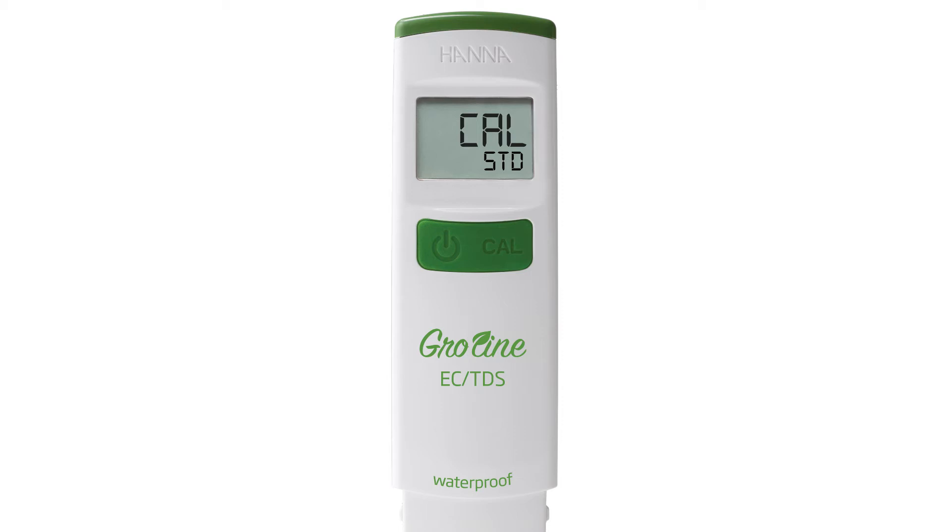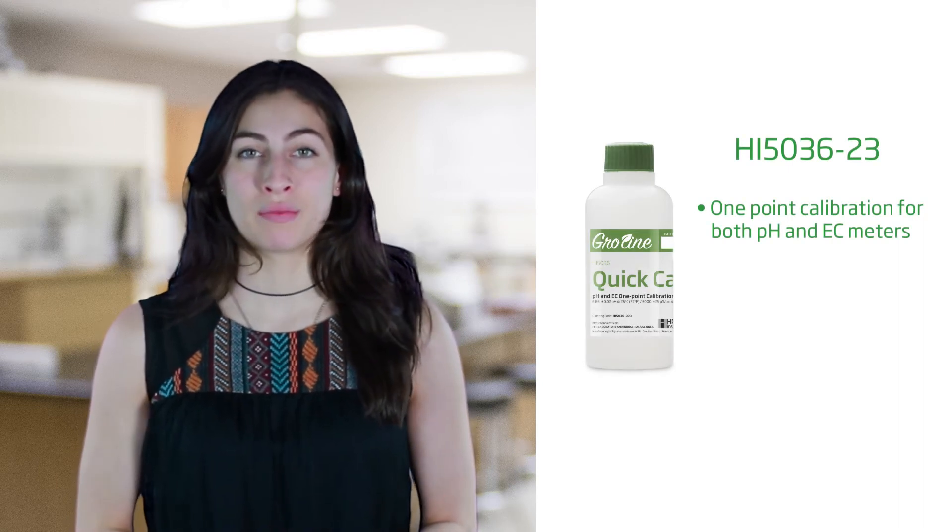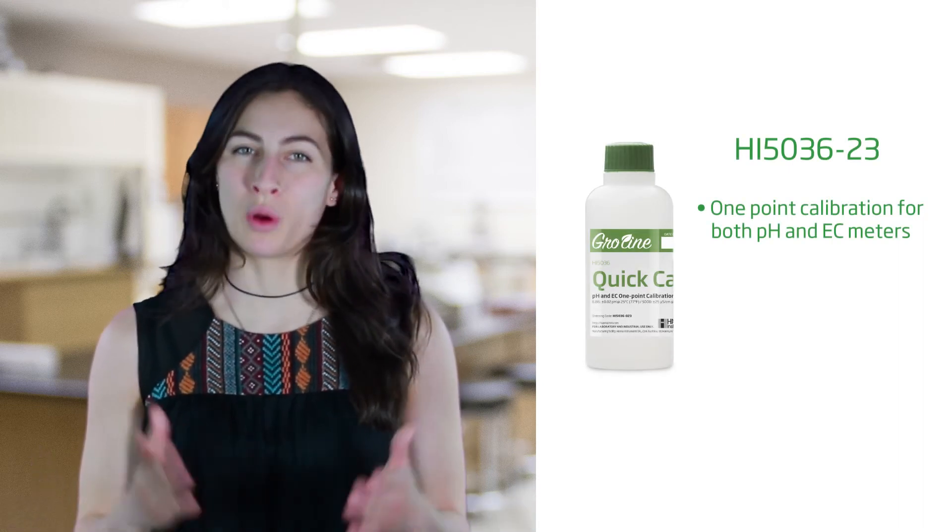The next setting in the menu is your calibration type. By pressing the CAL button, you can choose between CAL standard or CAL quick. The CAL quick setting lets you use the GroLine quick CAL calibration solution. This solution is for a one-point calibration in both pH and EC meters — it's like having two buffers in one bottle.